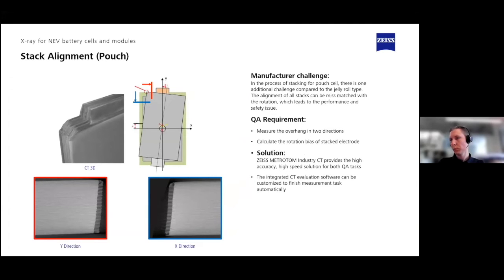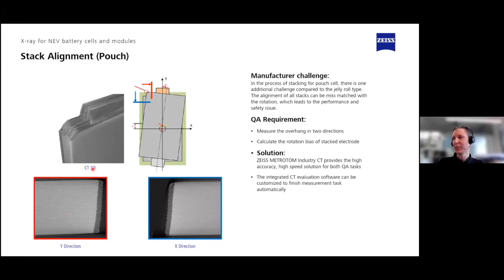You can also check the misalignment of the separator layers in a stacked cell. Here you can see the 3D data of the separator layers between electrodes. Then, by virtually cutting the sample into regions — the blue cut in the X direction, the red cut in the Y direction — and based on this information, you can then calculate the misalignment, meaning the angle between the different layers.